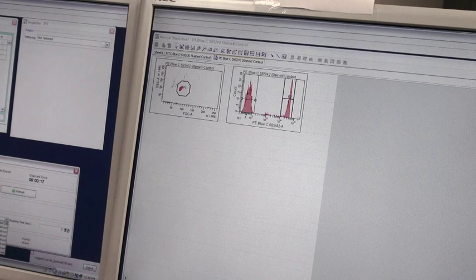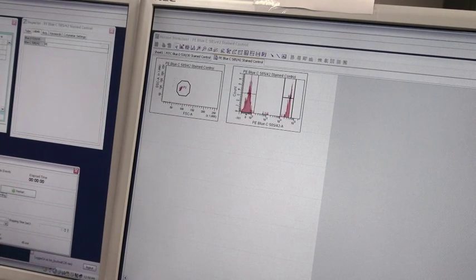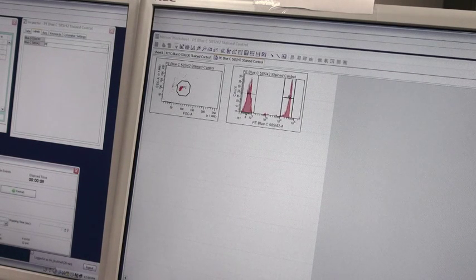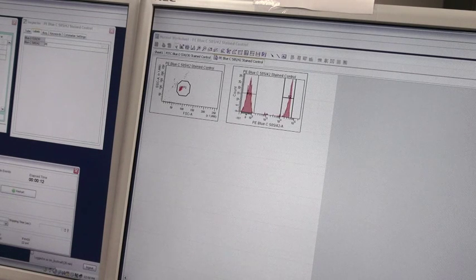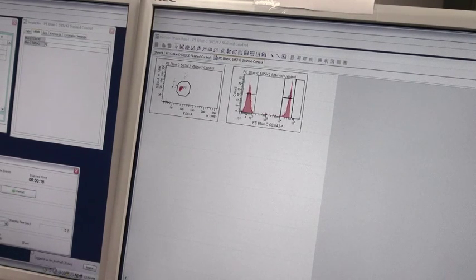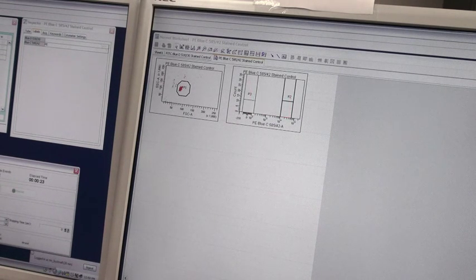Again, we will collect 10,000 total events, and once this is completed we will be able to compensate the sample correctly using the automatic logic that the software will run. This is in contrast to using the by-eye or matched median method that other instruments and people have been trained to use in the past.